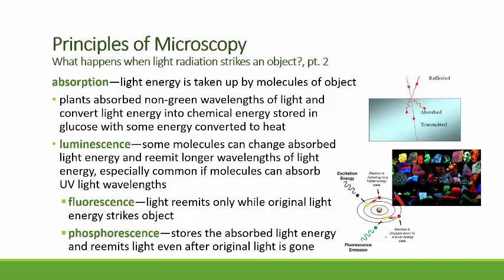But absorption is the idea that the light can come and it gets, these little squiggly lines here are showing the energy being absorbed by the molecules in whatever material the object is made out of. Now there are some cool things that can happen when light gets absorbed. Some molecules, not every molecule does this, are capable of storing the light energy and then re-emitting it.